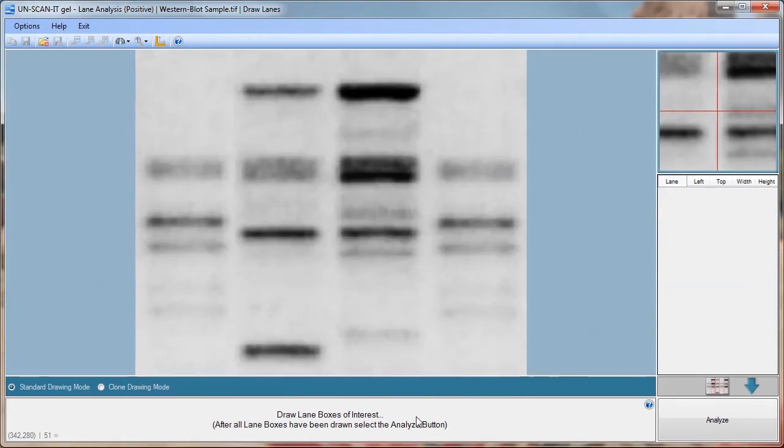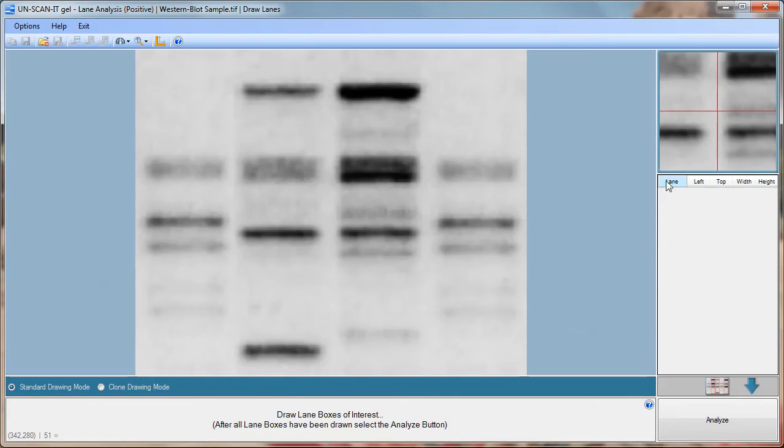The next screen is where you will draw the lane or segment boxes of interest on your gel image. For this example we will be drawing lane boxes. General instructions will be presented at the bottom of the screen. You can use the zoom toolbar option to increase or decrease the zoom level of the main image.